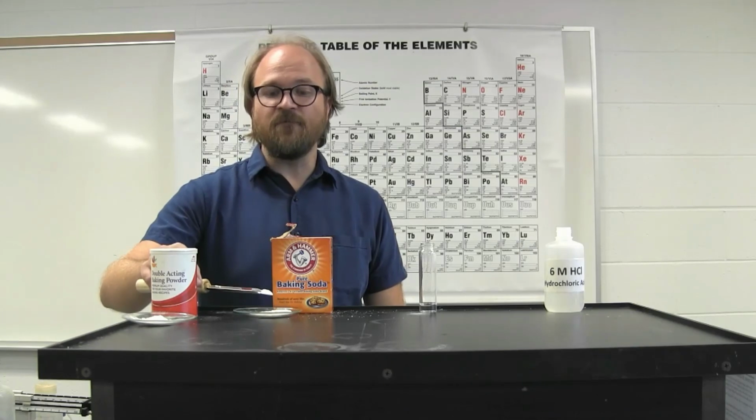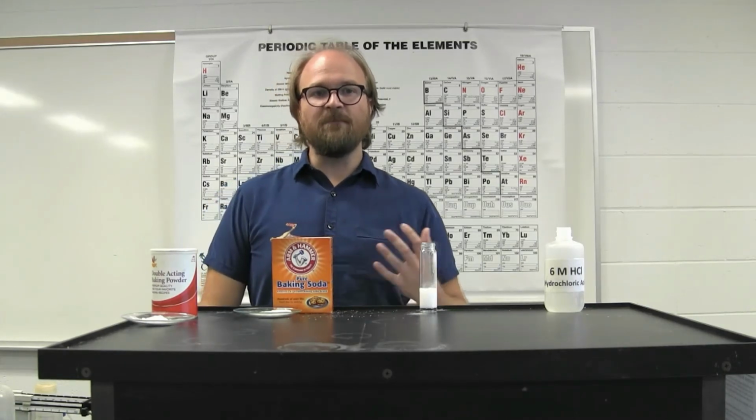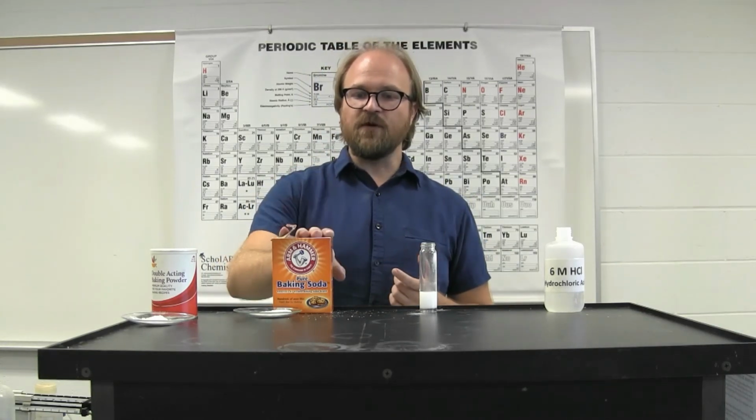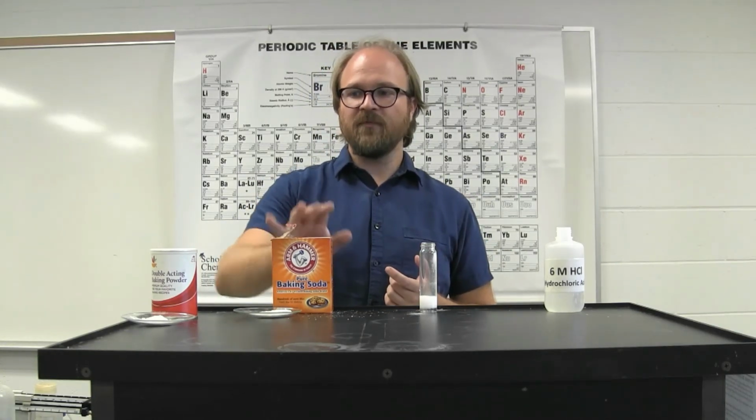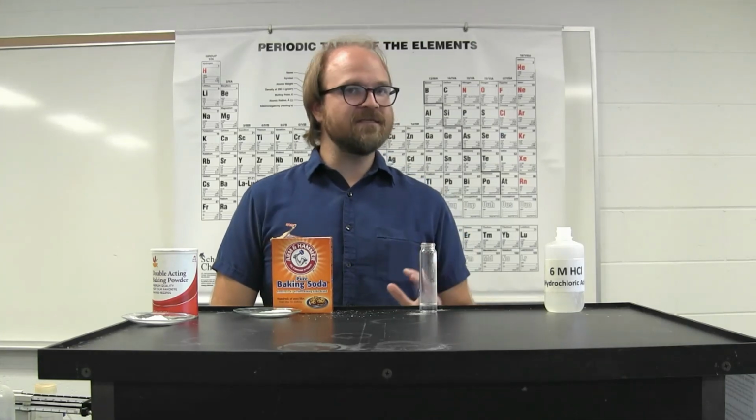You're looking at the masses before and after the reaction to figure out the mass of carbon dioxide, leading way to the mass of carbonate, and determining the percent carbonate of sodium bicarbonate, the percent sodium bicarbonate within baking powder, as well as the percent carbonate of an unknown compound, and comparing that to the list of possible carbonates to identify your unknown carbonate.